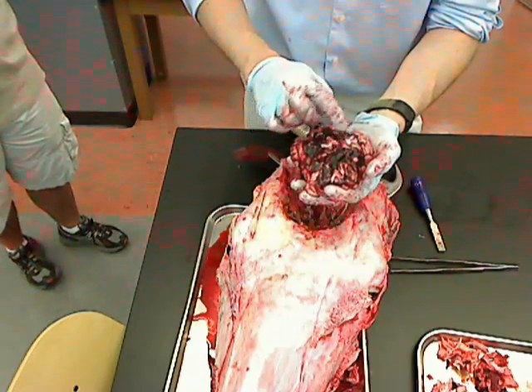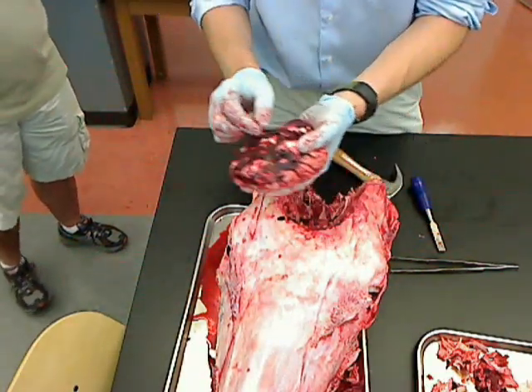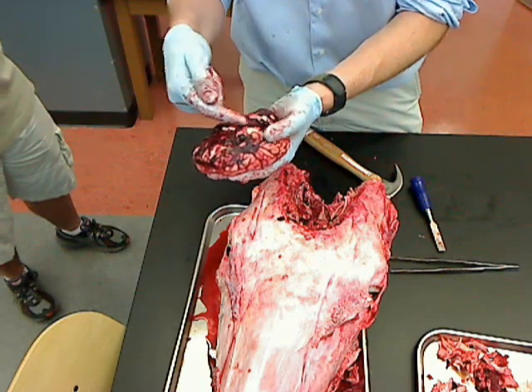I cut the optic chiasm. Instead of cutting the optic nerves, what I had was the optic chiasm. So that's after the optic chiasm has come through and these are going back.